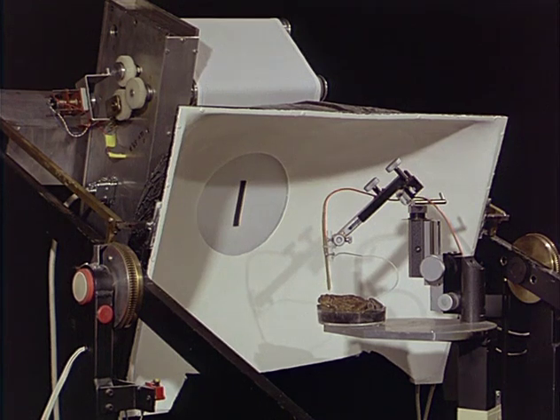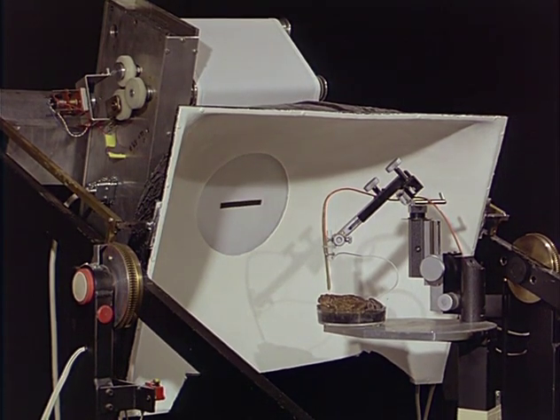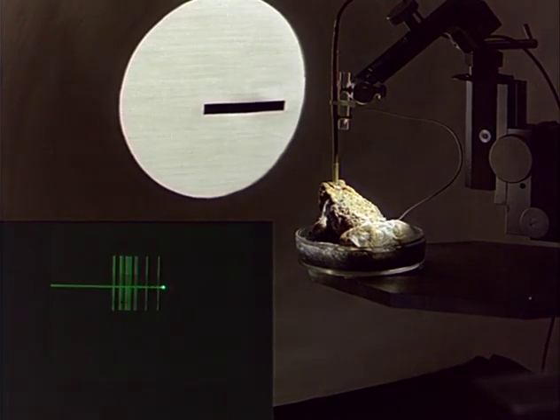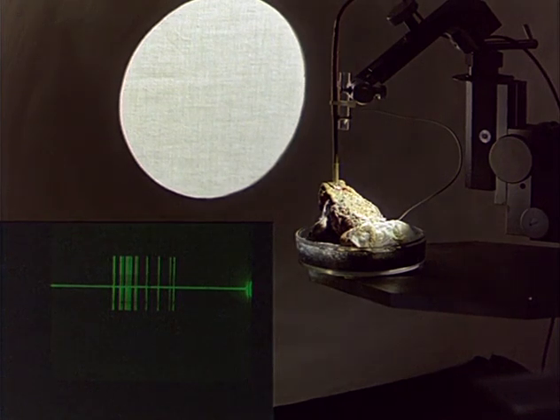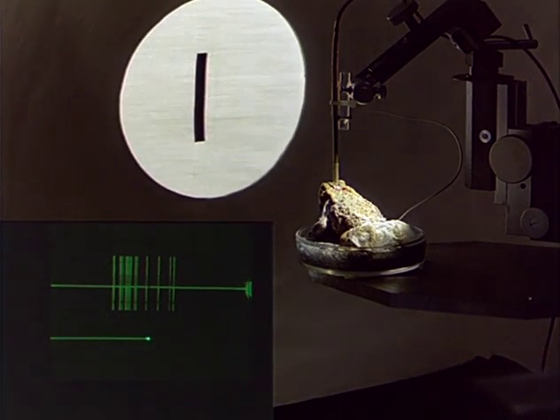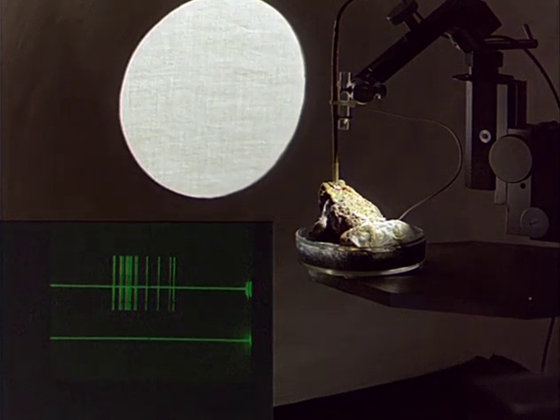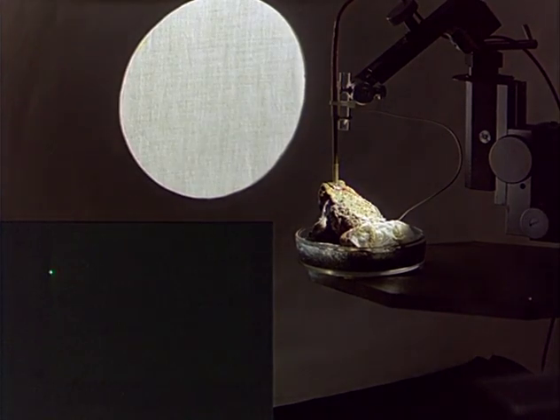During the recordings, the toad is anaesthetised and pharmacologically immobilised. First recordings from a neuron of the optic tectum. To a worm-like moving stripe, the neuron fires with high impulse frequency. The same stripe in anti-worm configuration remains practically unresponded. The worm preference is independent of the direction of movement.